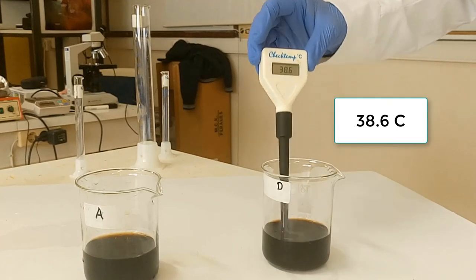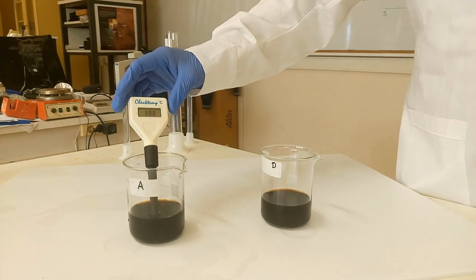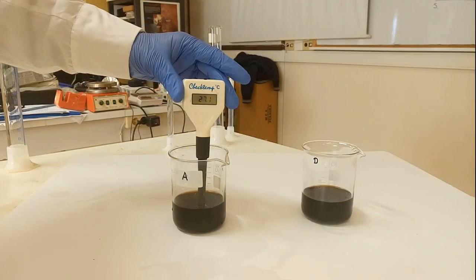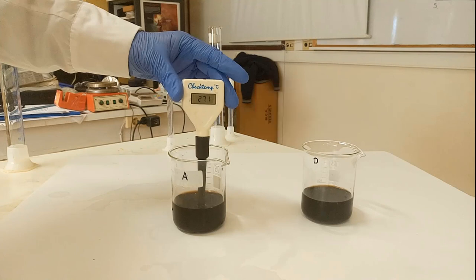In this particular experiment, increasing temperature by 11.5 degrees results in 2.4 times increase in reaction rate.